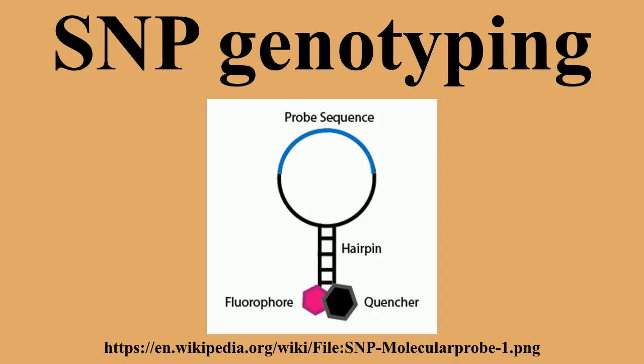If, on the other hand, the probe sequence encounters a target sequence with as little as one non-complementary nucleotide, the molecular beacon will preferentially stay in its natural hairpin state and no fluorescence will be observed, as the fluorophore remains quenched. The unique design of these molecular beacons allows for a simple diagnostic assay to identify SNPs at a given location.